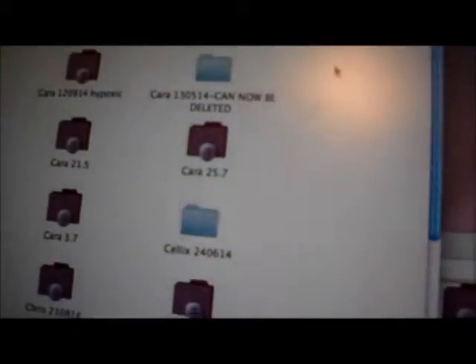So just drag that across onto the Mac for transfer one, and you can see it's about 7 minutes to transfer it. The icon just goes blue to start with, and then that will be filled in this purple format once the 6 minutes is over.